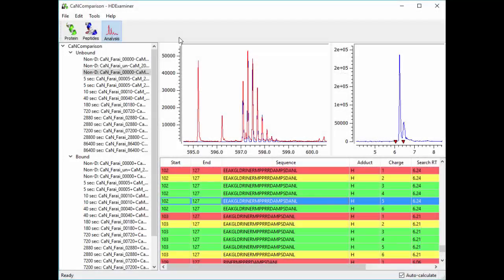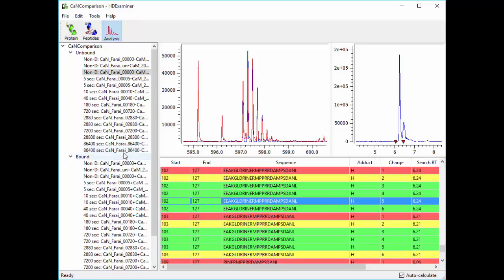So we're skipping ahead now. This is the same ligand-binding experiment, except now we've loaded all of our time points, including replicates in some cases, and we've analyzed all of the data.